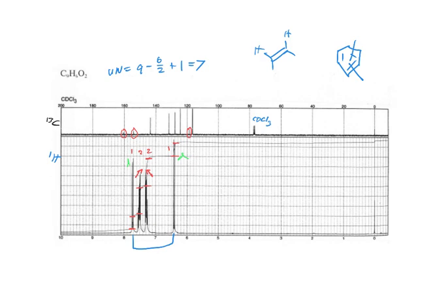I mean, they'd have to be para. So 2 substitutions would have to be para, because if you only have 2 signals that are potentially in the benzene ring, both of them are doublets, then they would be para. Well, those are each only worth a single proton, though. No, I'm saying in the middle. Well, the middle are not doublets, they're triplets, or something like that. Yeah, we can't really see exactly. But they look like they're kind of second order, too, maybe.